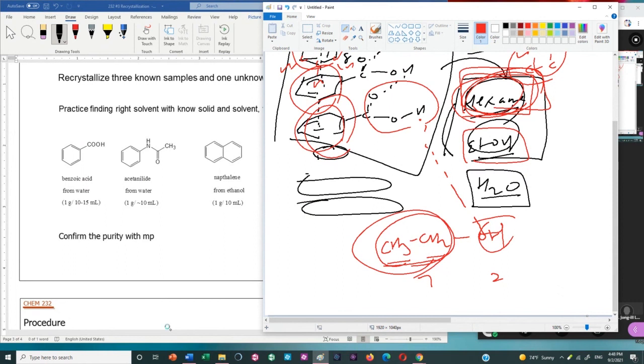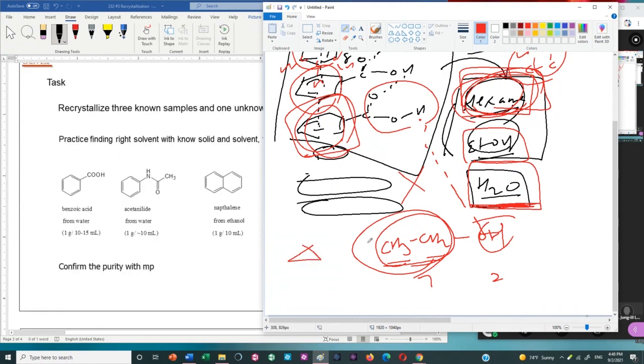Ethanol is not good. Okay then. Water. Water's extremely polar. They hate the majority, which is nonpolar, so not soluble. Okay? Not soluble. But they become soluble when you heat up. So what's the role of the heat?